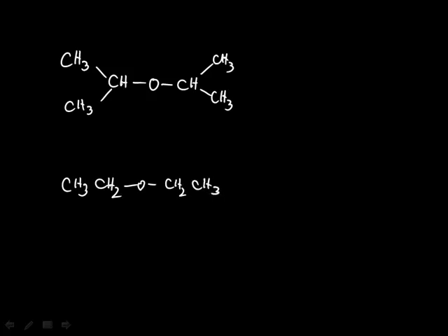their NMR spectra to some extent will be largely similar, because we'll have this methyl group. Well, both of them will have two peaks. One will come from the methyl group, so it will be relatively shielded. The other one will be significantly de-shielded, because it will come from a group close to oxygen. So from that perspective, both the peak positions and the number of peaks should be similar.